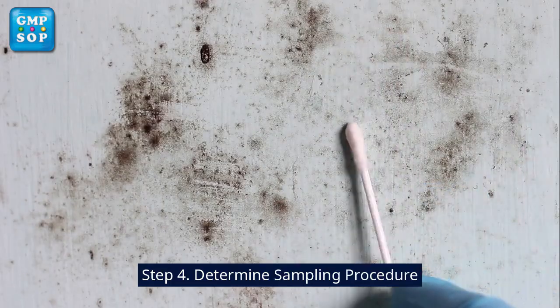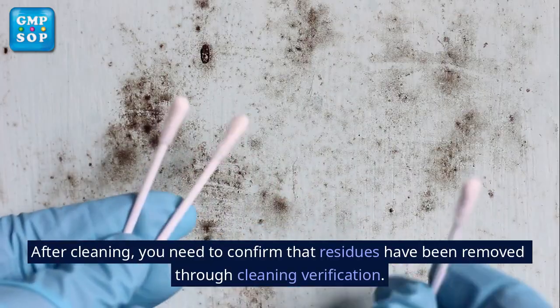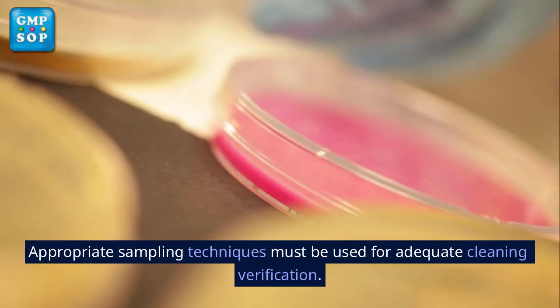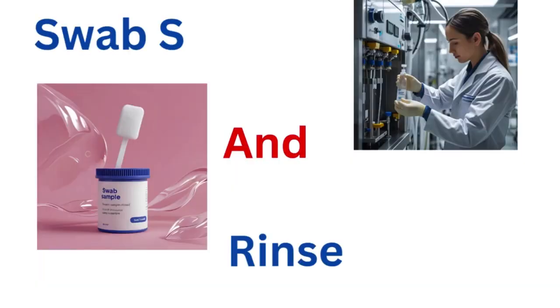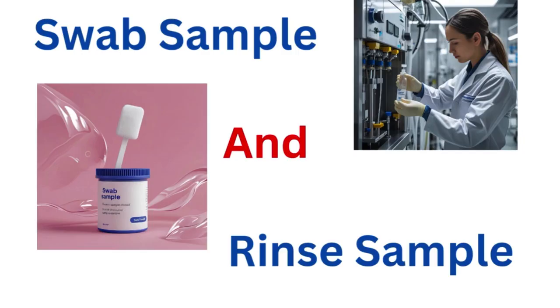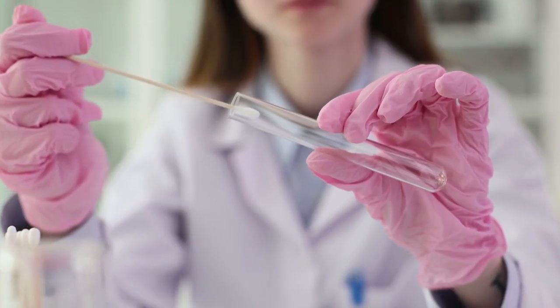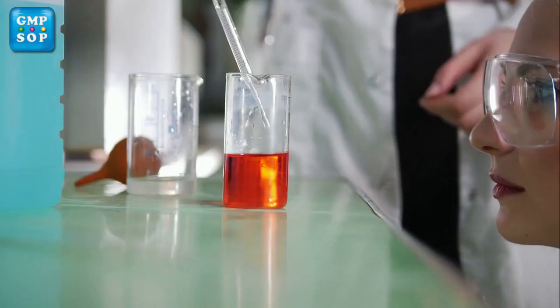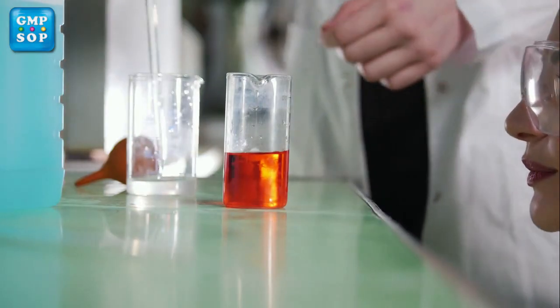Step 4. Determine sampling procedure. After cleaning, you need to confirm that residues have been removed through cleaning verification. Appropriate sampling techniques must be used for adequate cleaning verification. The two primary sampling methods are swab sampling and rinse sampling. Swab sampling involves wiping a defined surface area with a sterile swab to collect any remaining residue. Rinse sampling involves collecting the final rinse water that has passed through the equipment surfaces.